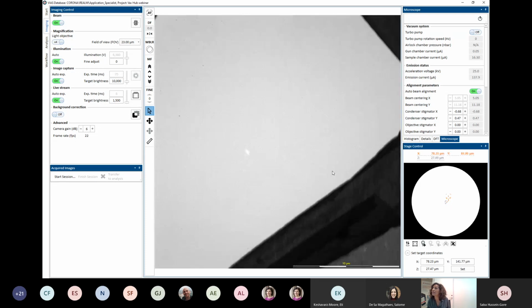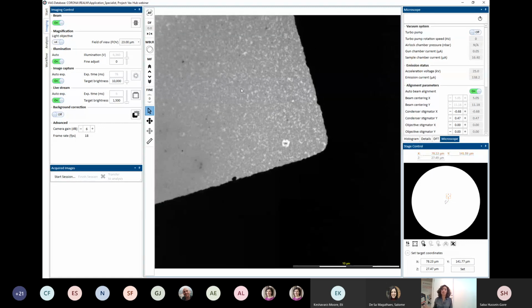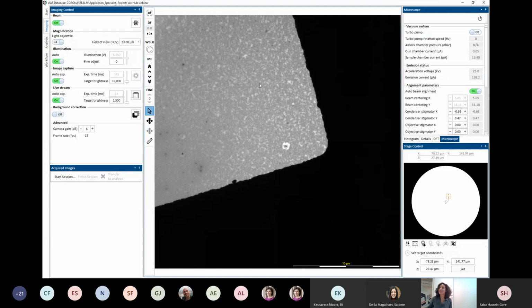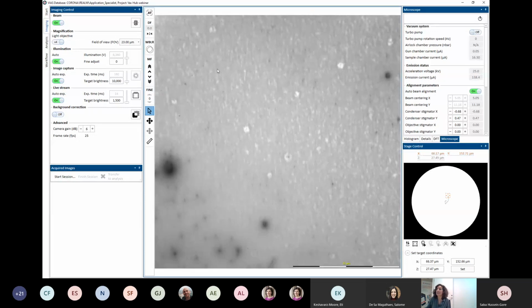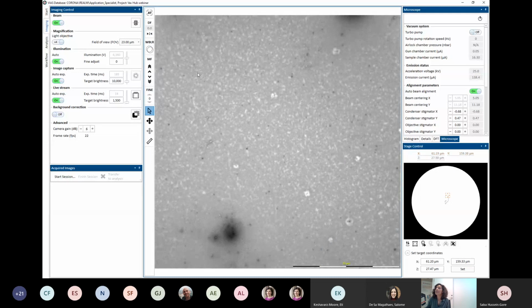And see, now you won't feel bad when you have a ripped grid, because you will remember how totally ripped our grid was, which is fine. Okay, let's hope that this one looks good. Okay, this is looking better. This is looking better. Okay, let's use this one. Let's stay here.